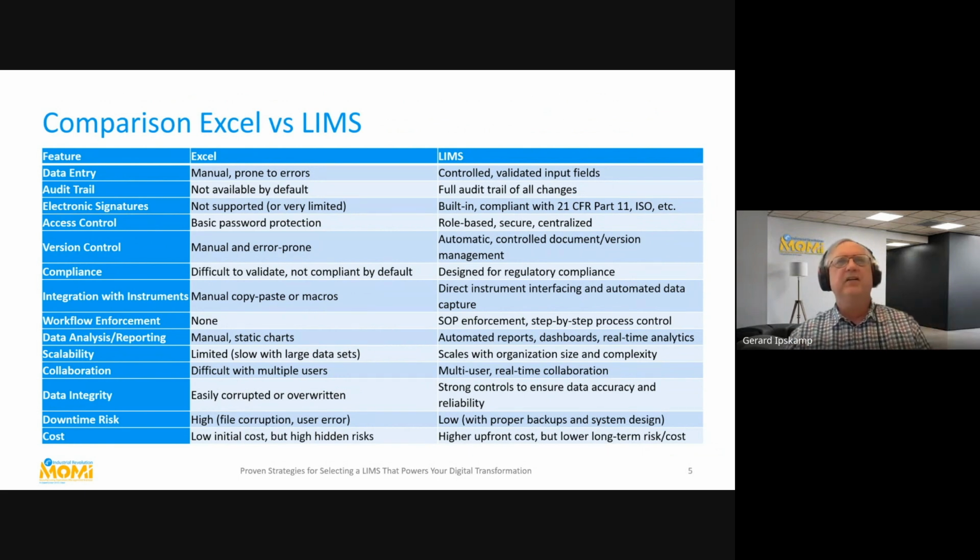In all those years, I collected a kind of list that compares these, because you always have this discussion. I will not go through every item, but for example, audit trail is always, and the more regulated you are, the more discussions you have about it. In Excel, you don't have an audit trail. You cannot see who did what, when, where, what was changed, etc. And all the LIMS systems I know, serious LIMS systems, there is an audit trail. Sometimes not easily accessible, but that's a different discussion, but it is there. So if you want it, then it's there.